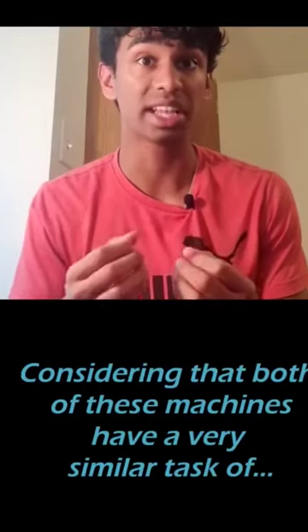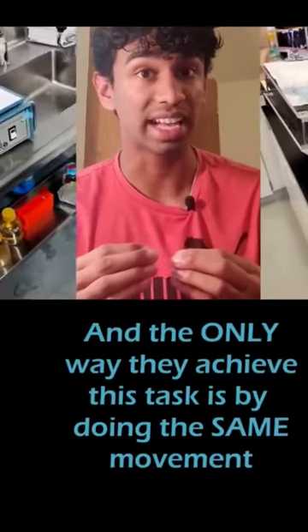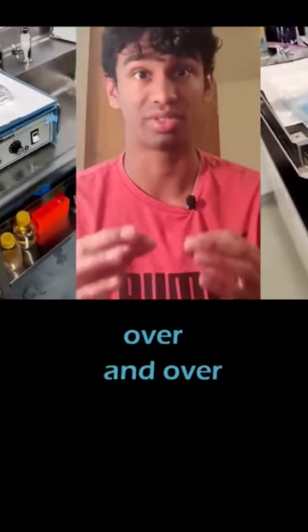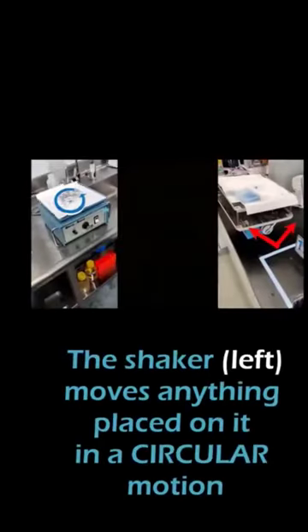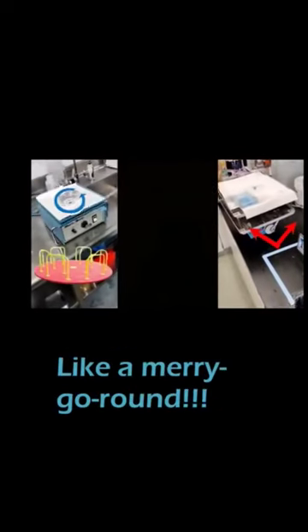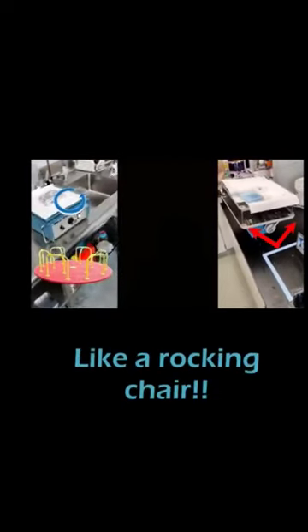Considering that both of these machines have a very similar task of mixing stuff, and the only way they achieve this task is by doing the same movement over and over and over again. The shaker moves anything placed on it in a circular motion, like a merry-go-round, while the rocker moves its samples back and forth on the platform, like a rocking chair.